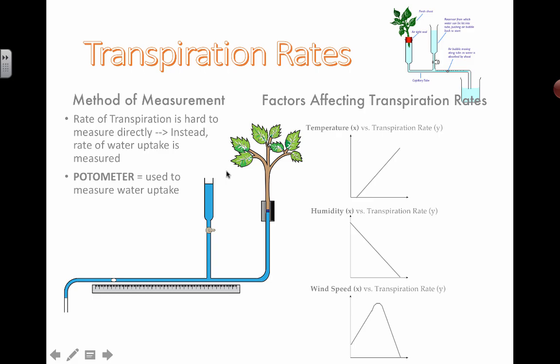That's the basis of this entire thing. And if you need to move the bubble back around in some potometers, there's a little reservoir here that you can open up to move a bubble around. You could just use the end of the water here and actually use that and measure the movement of that. Or you can introduce a bubble into it and then measure the movement of the bubble. It doesn't matter. There are many different ways that you can do this. But this is one of the standard methods that you should understand how to use. It's called a potometer.